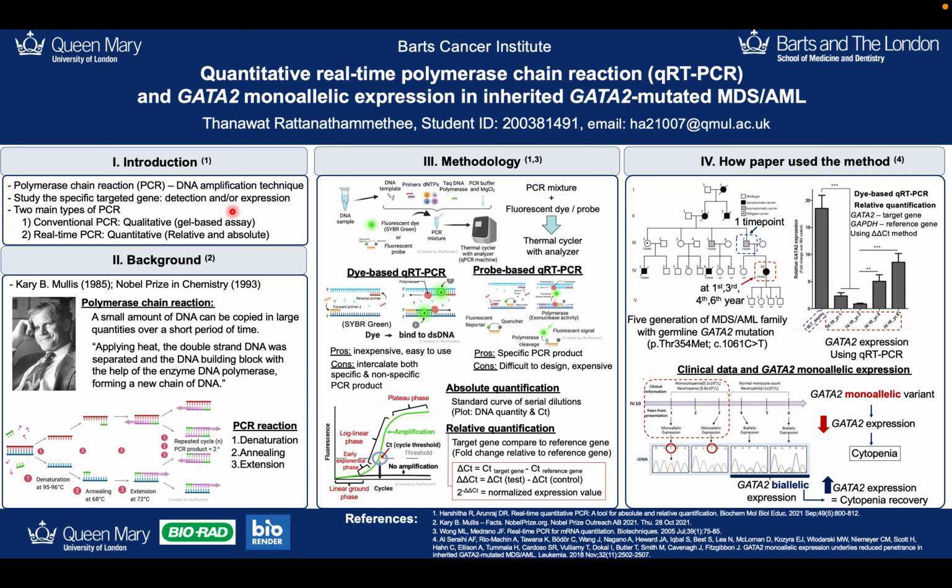PCR can be divided into two types. First is conventional PCR, which is the qualitative measurement based on gel electrophoresis. The second one is real-time PCR, which is the quantitative measurement of DNA or gene in absolute or relative values. Today I will focus on the real-time PCR technique.